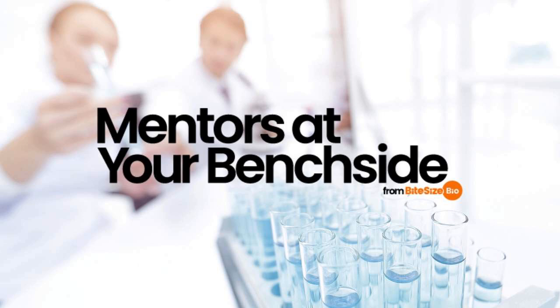How to prepare high-quality hepatocyte suspensions for your counts. Preparing a high-quality sample of hepatocytes is the critical first step for producing reliable, accurate, and reproducible data, including the final count. An optimized extraction protocol will increase cell viability and yield, maintain cell function, minimize contamination, and reduce the need for troubleshooting and repeating experiments.